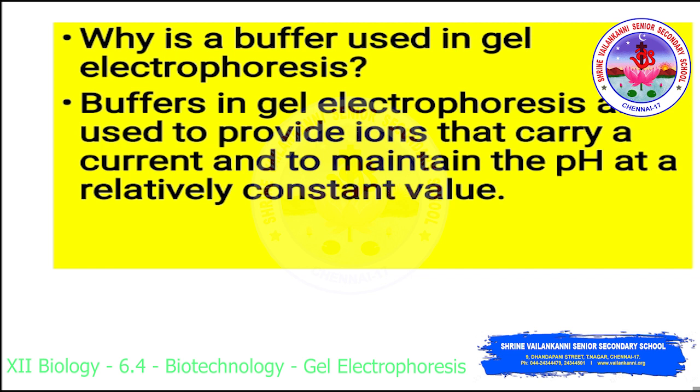Why is a buffer used in gel electrophoresis? This is a frequently asked question. Buffers in gel electrophoresis are used to provide ions that carry a current and to maintain the pH at a relatively constant value. So please make a note, students.